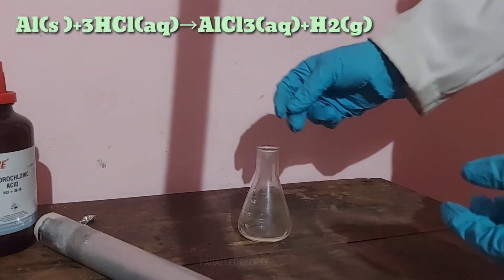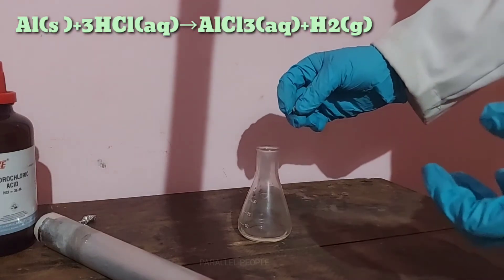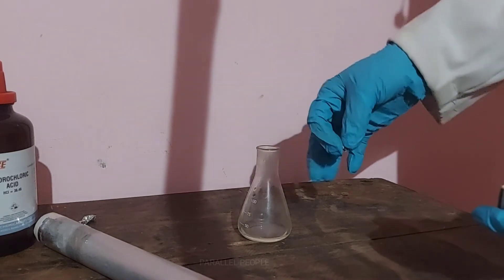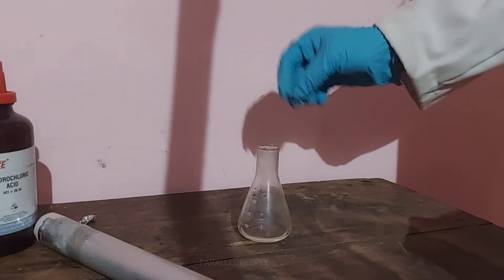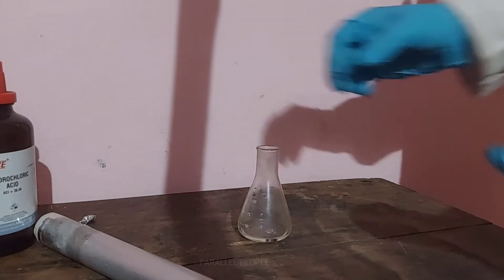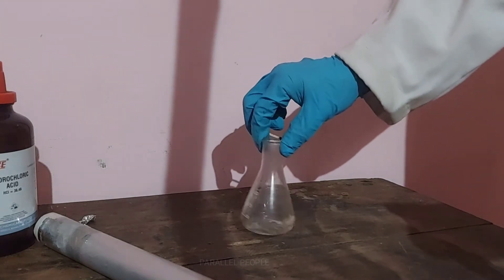When aluminium metal reacts with hydrochloric acid, it will release hydrogen gas. This hydrogen gas is highly flammable. However, there is no attractive color when burning this hydrogen gas — that's why we need copper sulphate, as you will see later. But first, let's see the burning of this hydrogen gas. We just drop the aluminium metal inside the hydrochloric acid.